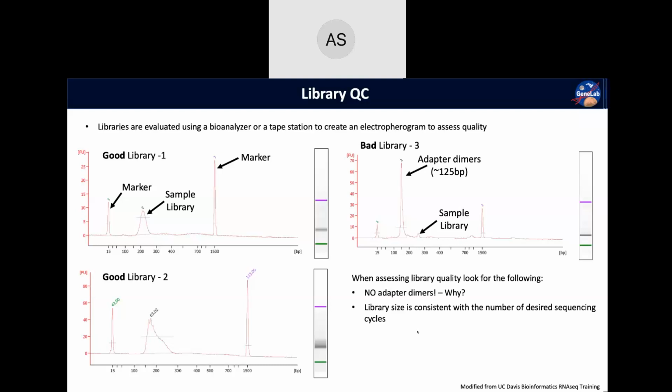Any guesses? Yeah, right around 300 or just under. It's really nice when you're sequencing in both directions. You want to be able to fully sequence your fragment. If you had inserts of exactly 300, you would sequence 150 in the forward direction and 150 in the reverse direction, and you would cover your whole sequence. But it's nice and helps a lot with the alignment if there is some overlap between your forward and your reverse read. Usually about 20 to 30 base pair overlap is pretty ideal.